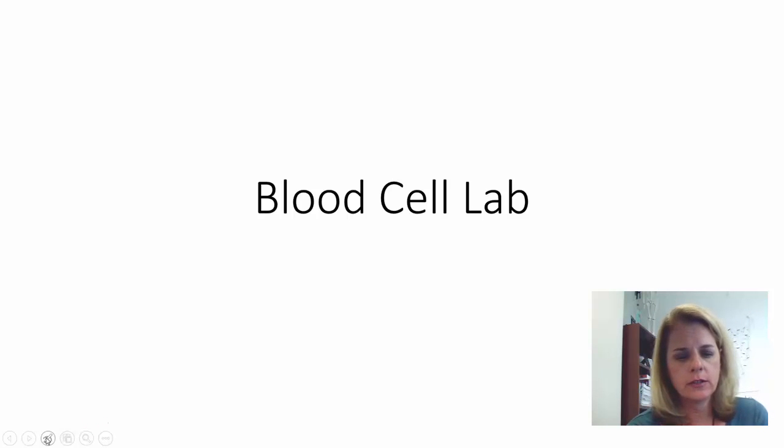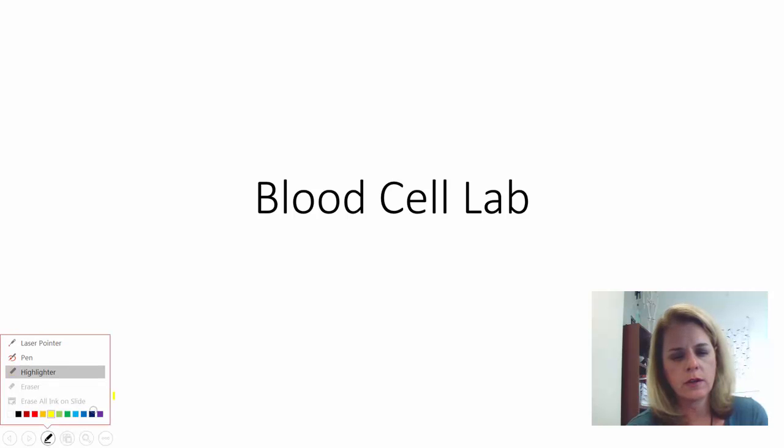We're going to do the blood cells. This will be pretty short. There's not a whole lot to the blood cells. The other part of your lab will include the blood vessels, and that'll be a little more in depth.